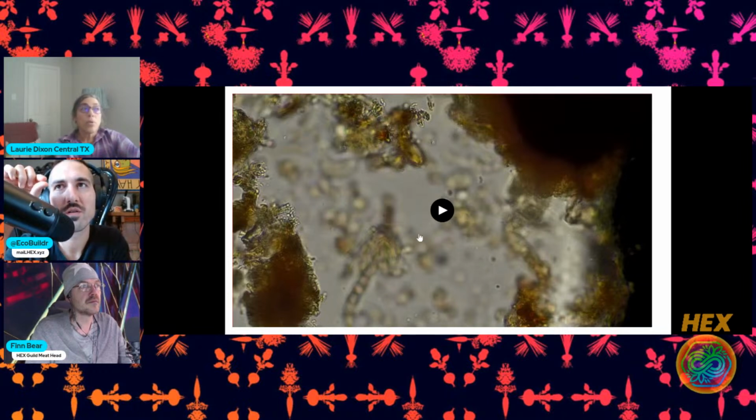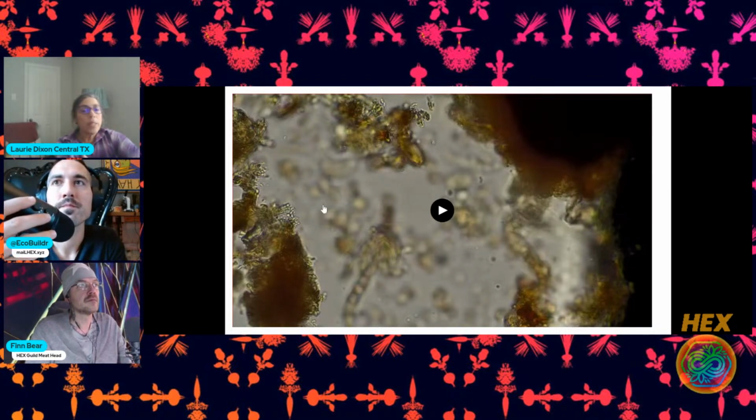What sort of petri dish, or is it literally between the slides, between glass? It's between the slides. So we go out, we take a soil sample, we bring it into the lab, we make a dilution, and we make different dilutions because we don't want it too crowded. This dilution is probably a 1:8.